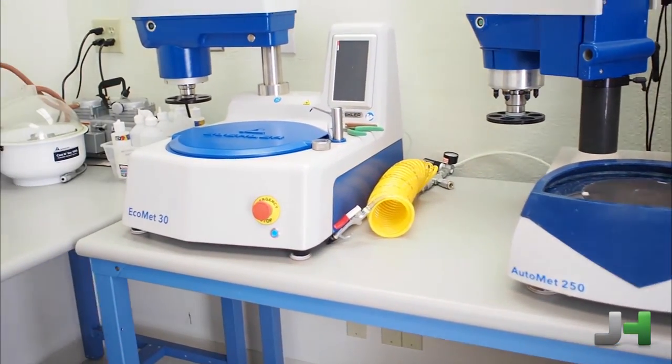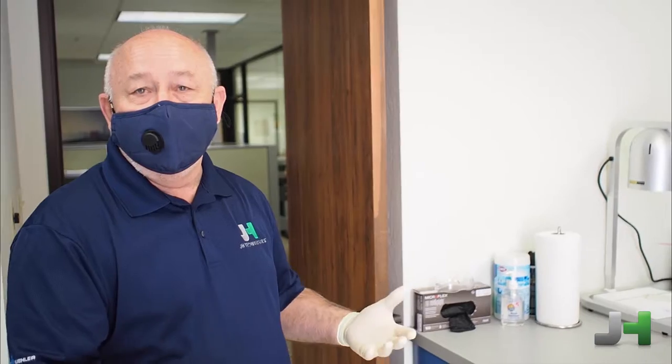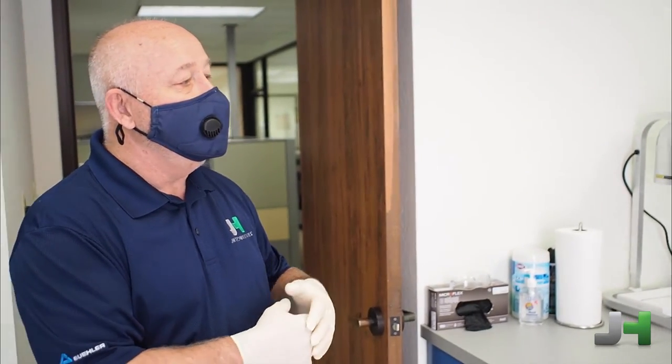Both of these instruments are being used on a regular basis, both to process parts and also to show our customers what they can do with the equipment. So we run a full lab. Our customers can come in at any time, use the equipment to get an understanding of how it would work for them.